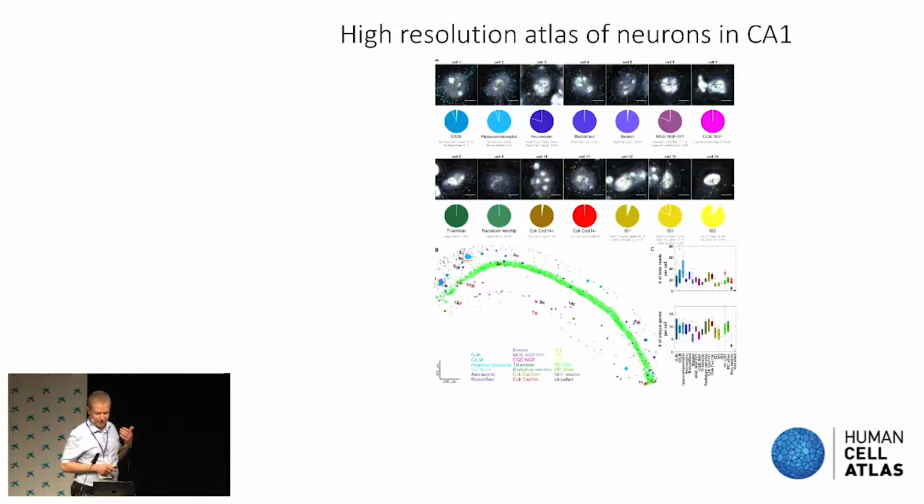So we can validate that the cell maps we generate actually make sense. What's extraordinary is that the maps are accurate. They really reflect what is expected in terms of the frequency of these different cell types that are quite rare, and their location in the tissue.